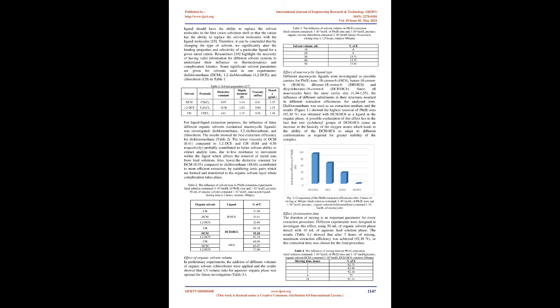3. Results and discussion. Optimization of experimental variables. A series of experiments were designed to investigate the effect of different parameters, type and volume of organic solvent, counter-ion concentration, pH value, type of macrocyclic ligand, stripping agent concentration, and extraction time, on the efficiency of the extraction procedure. All investigated parameters were optimized to achieve the highest possible extraction capability of Pb²⁺. It was found that the extraction of analyte ions is not possible in the absence of counter-ions in feed solutions, hence the preliminary experiments were carried out using picrate as counter-ions, as well as the final proposed procedure.